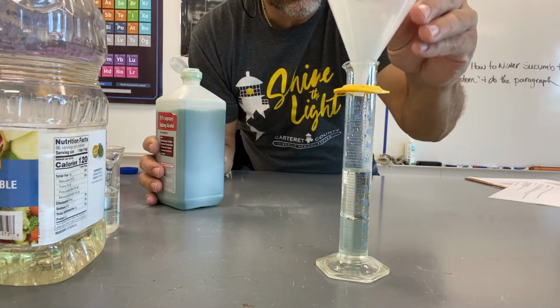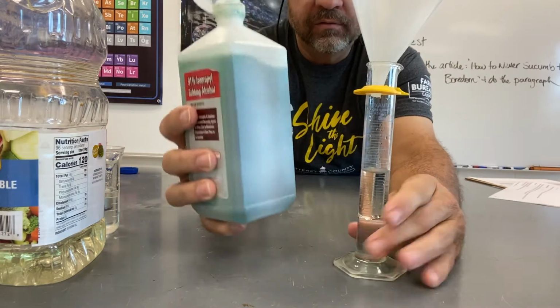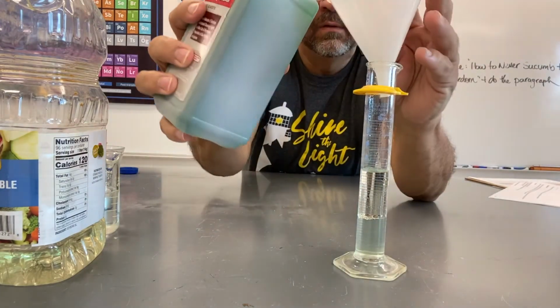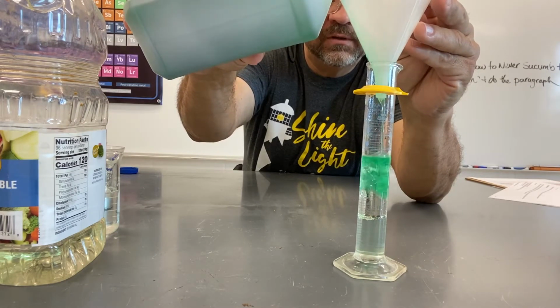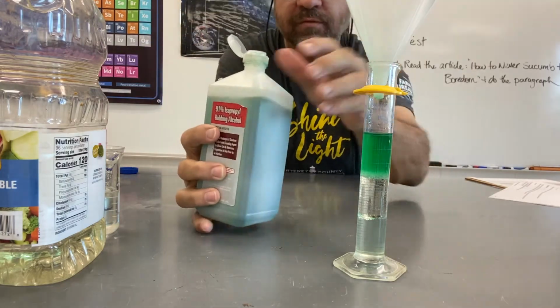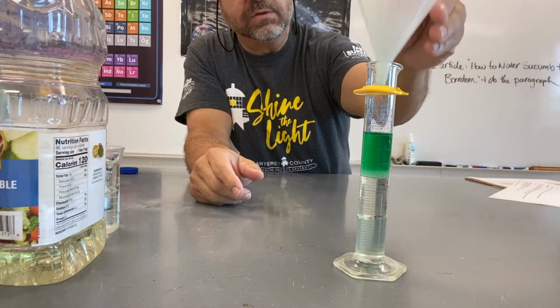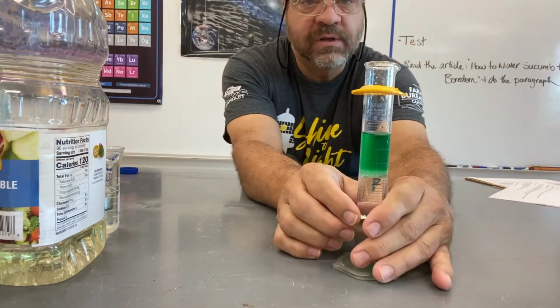And then finally, I'm gonna put about 15 milliliters of alcohol. Again, this is the 91% rubbing alcohol that we used in our last demonstration. So 15 and 15 and 15 is 45, so I'm gonna stop at 45 so that we have close enough to equal amounts of all these three liquids.